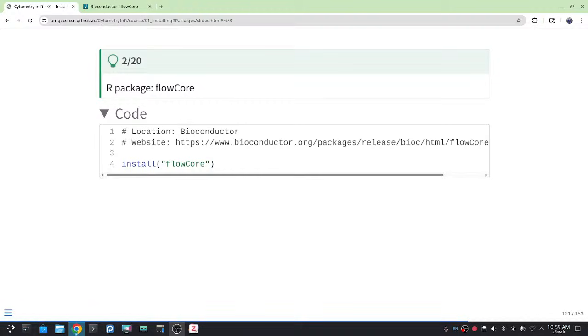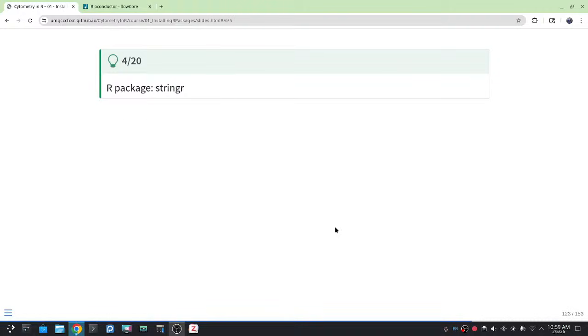So at this point, let's double click. There are about 20 different packages to install. I did update a couple of things this morning to make sure the install commands were correct. There are a couple of GitHub packages present that I'll let you figure out. The main thing to remember is that packages you can find on Bioconductor and CRAN may also be present on GitHub. So oftentimes, if you are trying to identify something that's only available on GitHub, it's the absence of a CRAN and a Bioconductor website that gives it away.